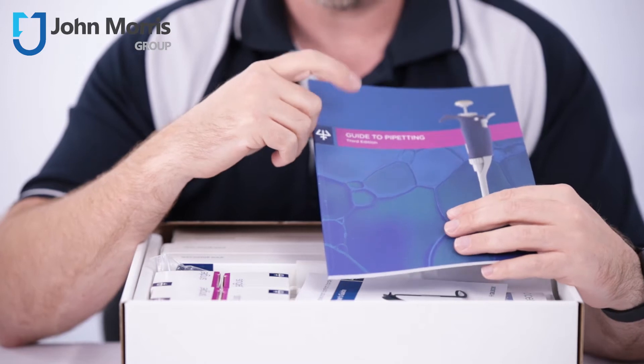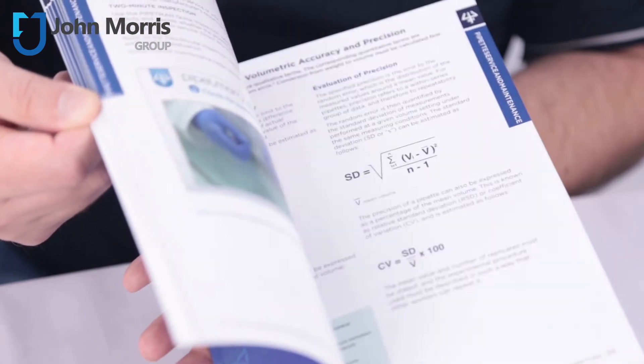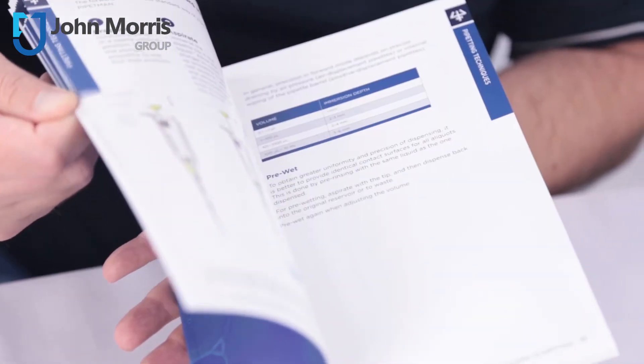You'll find this third edition guide to pipetting. It includes all the common pipetting techniques, the different kinds of pipettes from air displacement through to positive displacement, and you'll also find tips and tricks on calibration and maintenance of your Gilson pipettes.